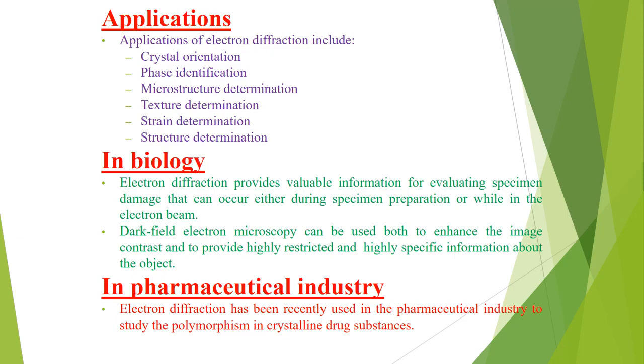Dark field electron microscopy can be used both to enhance the image contrast and also to provide highly restricted and highly specific information about the object.